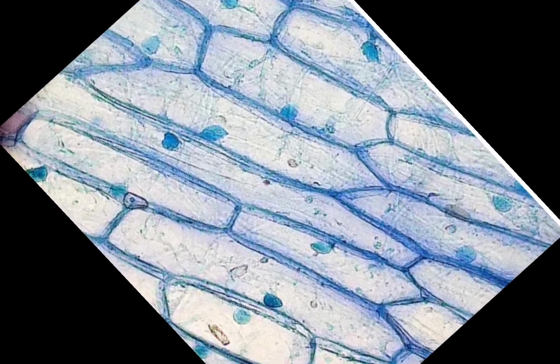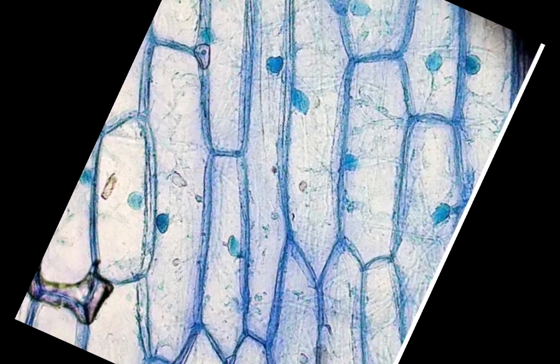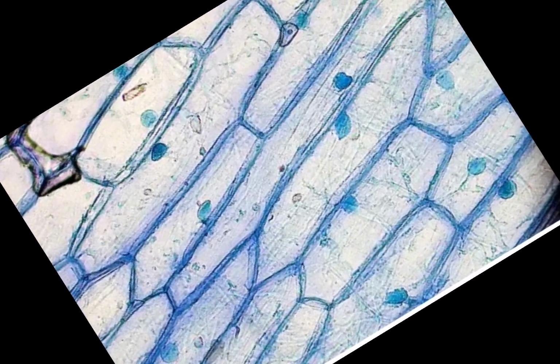This diagram is showing how onion cells appear when methylene blue is used. With iodine solution, the cell will look like this in this diagram. And finally, without staining, the cells will look like what is in this diagram. So let us move straight to the discussion and conclusion for this practical.